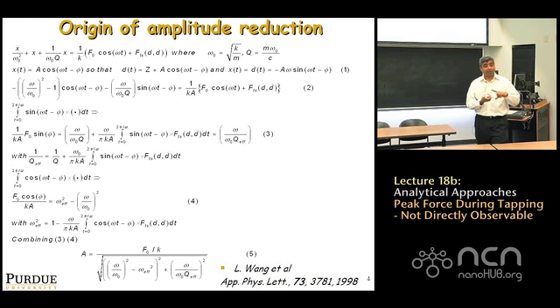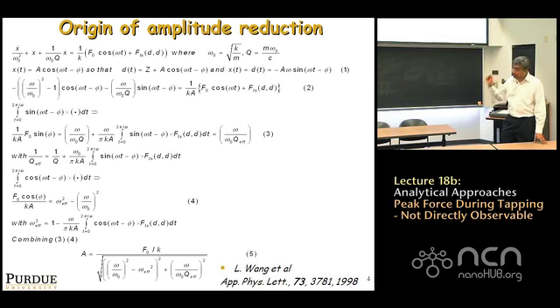Is it the tip sample force gradient, i.e., is the topography you get in tapping mode AFM basically a contour of constant force gradient over the sample? Or is it a contour of constant dissipation over a sample? What is it? So we're asking now a very fundamental question. You get an image, but fundamentally in terms of forces, what is it? By keeping amplitude constant, are you keeping the force gradients constant or what, right? This is an important question. So this is what this paper tried to address.